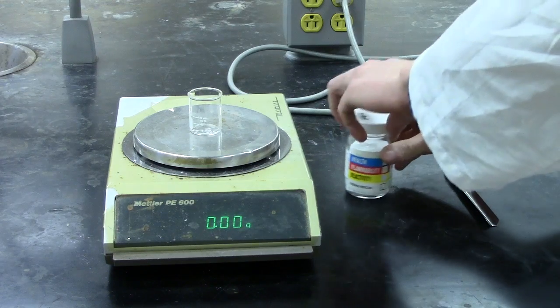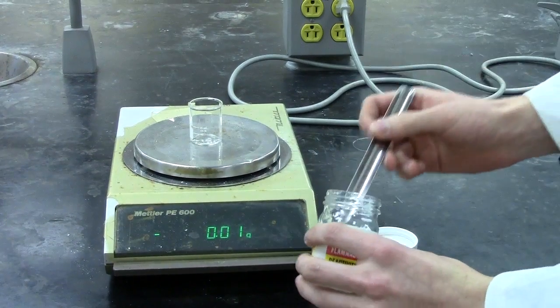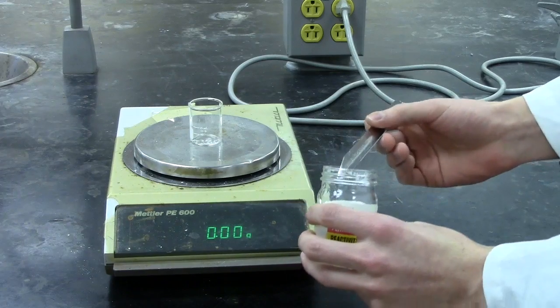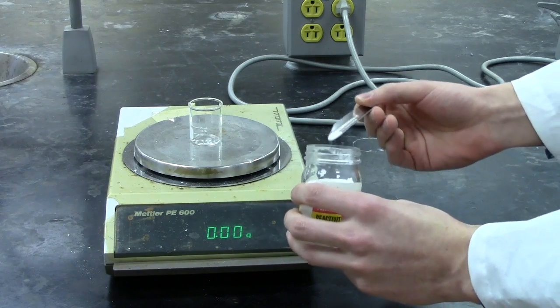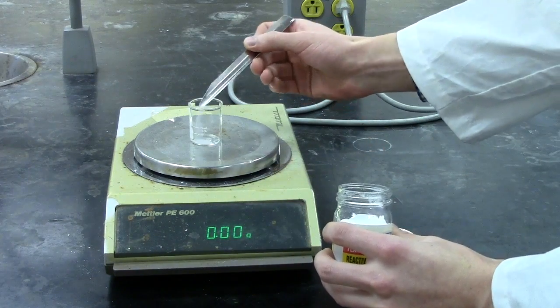So with your vessel loaded onto the top loading balance, you can now measure out the mass of your given substance. Let's say you're aiming for roughly one gram.